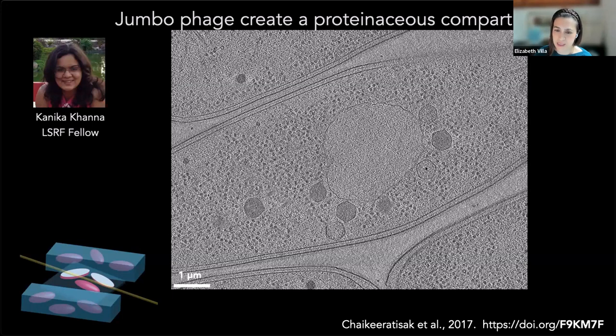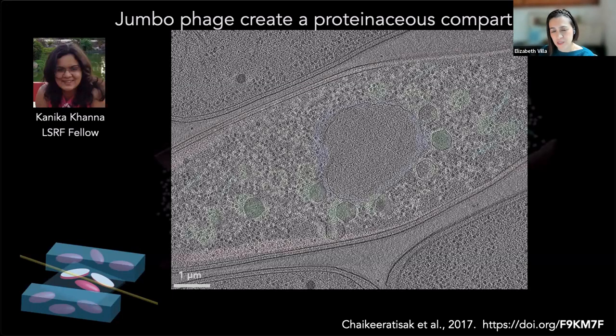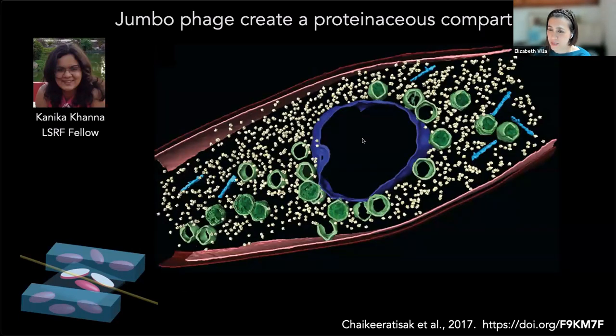So you can see here a capsid that's basically more or less empty, a capsid that's more full. And then at some point, these capsids seem to graduate as they get enough of all their genome inside and come and get a tail and so forth. The other thing that I want to point your attention to, other than this protein being a single layer of protein, is that the ribosomes, you just see here segmented in yellow, are actually completely excluded. So I'm telling you, the genome is inside of this compartment, and the ribosomes are outside.